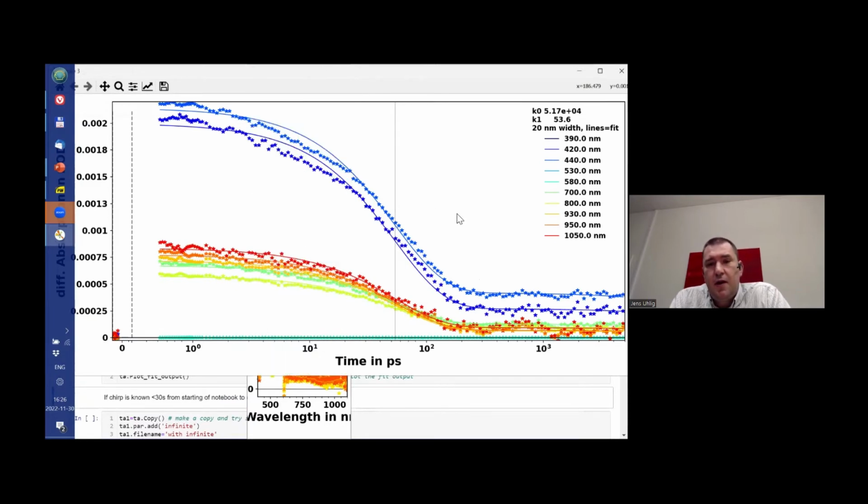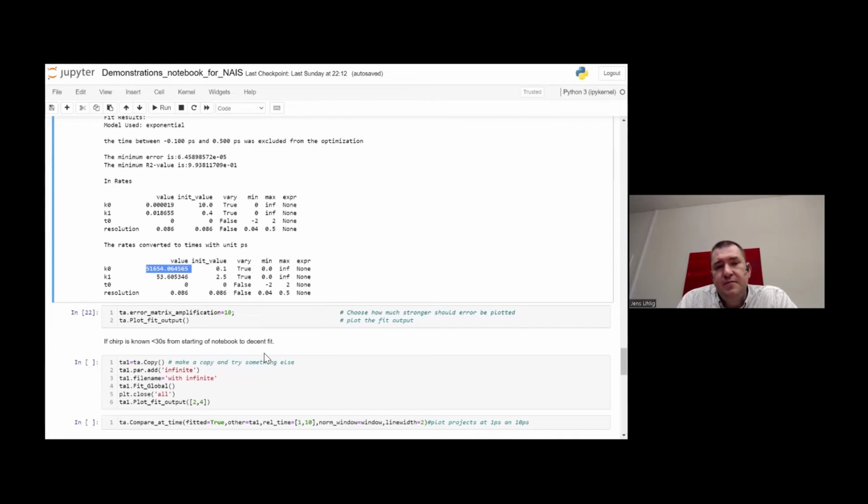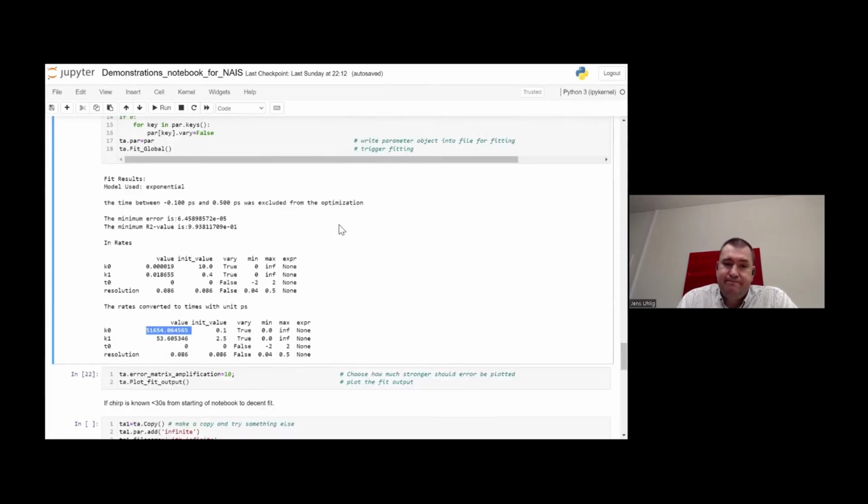Take that window. And maybe, for example, if you look in here, when one sees the time points I fitted, I've drawn them by line. There's an infinite time. There's one kinetic decay, which is maybe not quite as good. And if I look at the data again, I see that, yes, one of the kinetics wants to make an infinite fit, and one is something like 60 picosecond. Maybe that's not as bad. So maybe let's optimize my fit.